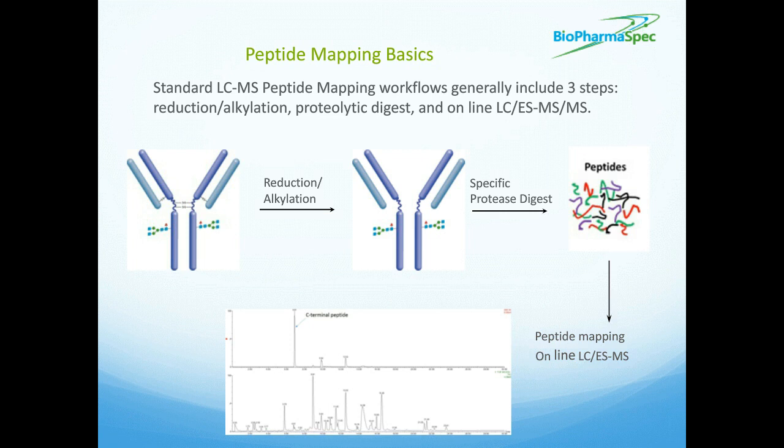Peptide mapping allows for the identification by mass and characterization by MS/MS of these masses by inducing fragmentation to determine sequences. Peptide mapping is really important for host cell protein analysis because it allows us to assign a specific retention time and fragmentation pattern to a known host cell protein peptide. And then we will screen all of our subsequent samples for these known peptides.